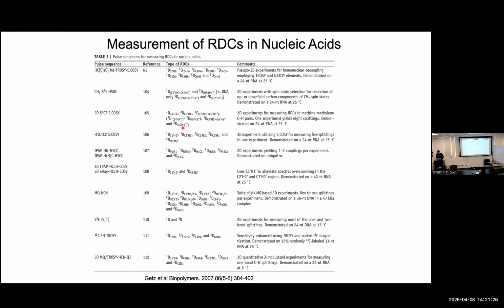Then you measure the same resonance as a function of varying the little delta, and then you fit that to cosine pi J delta. So by NMR, you can encode J couplings in the intensity, but you have to do multiple measurements, varying that contribution so that you can actually solve for the J value. Those are very powerful quantitative approaches.